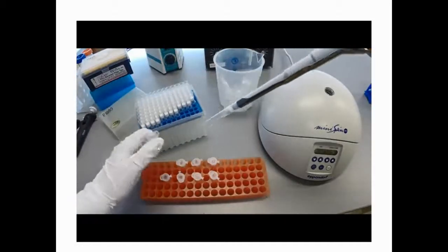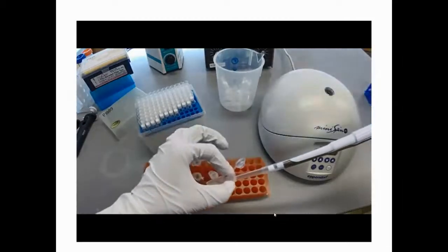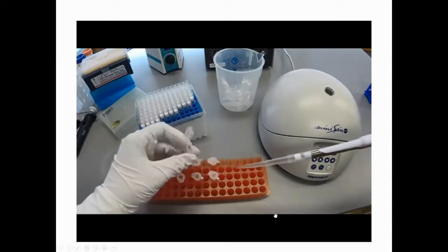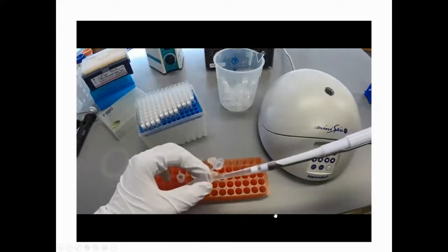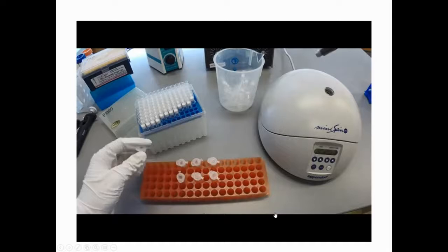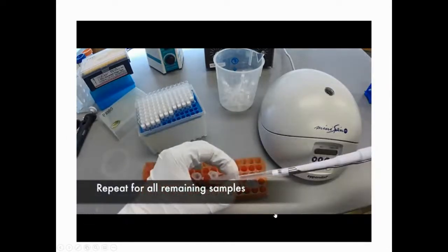So after all the treatment, now you transfer the supernatant, which includes the DNA. Place the tip on the opposite side of the tube from the pellet and draw up slowly to avoid disturbing it. Repeat this process for the remaining samples.